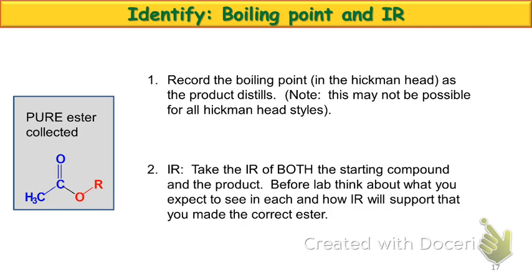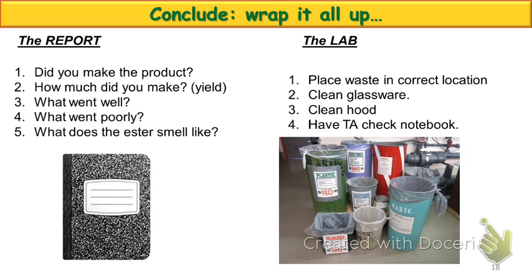So what are we going to use IR to do? Confirm the lack of starting material. What peak do we expect to not see? You shouldn't expect to see water, that's true. There's a better one. What was your starting material? An alcohol. We would not expect to see the OH peak. Okay? At the end of that, you just clean up. If you got questions about the group activity, raise your hand and ask.